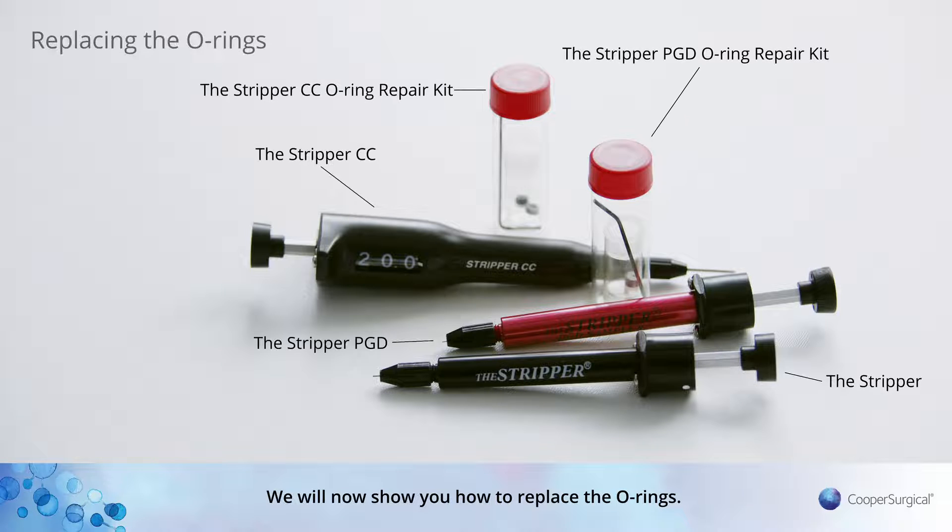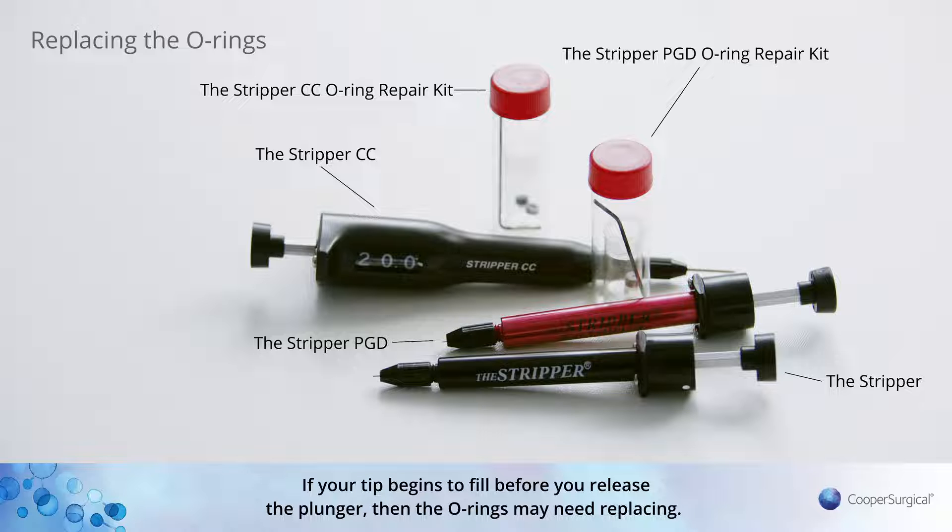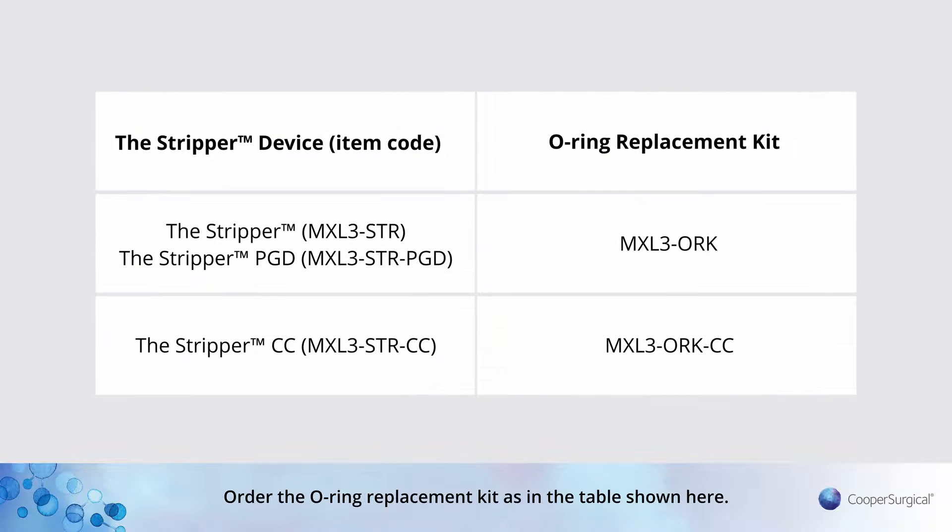We will now show you how to replace the O-rings. If your tip begins to fill before you release the plunger, then the O-rings may need replacing. Order the O-ring Replacement Kit as in the table shown here.